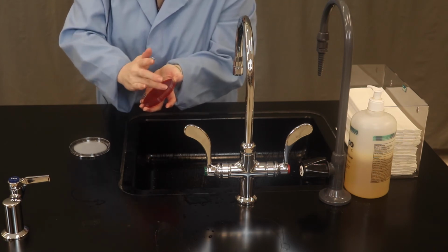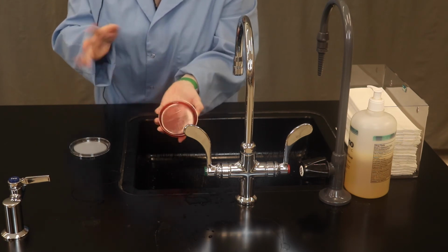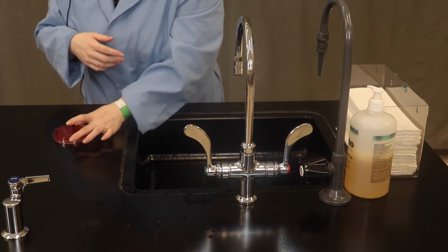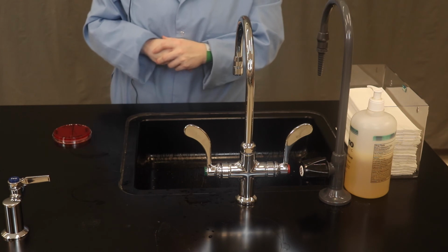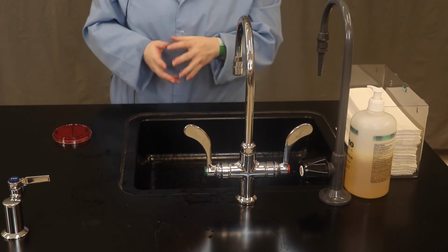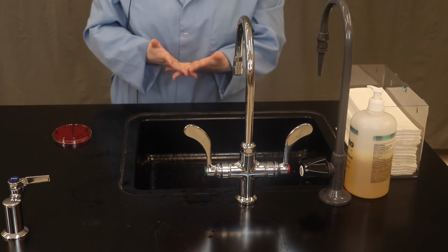And we're going to incubate 24 to 48 hours. We're going to look at examples of this in D2L, and we're going to count colonies before and after and see how effective that method of hand washing was.